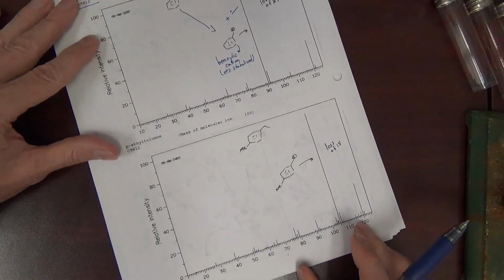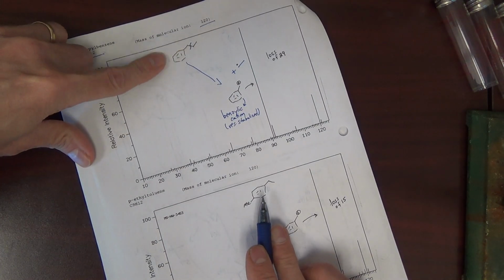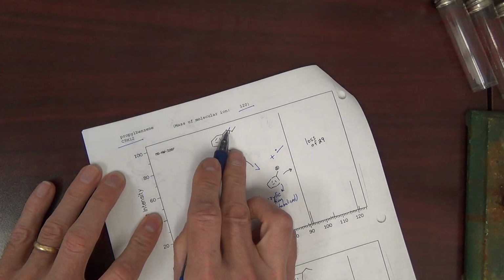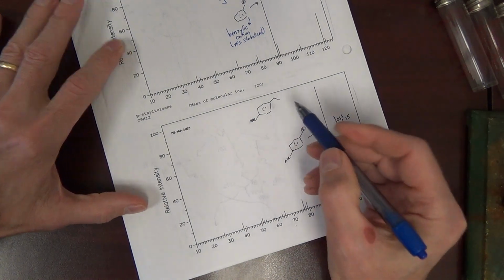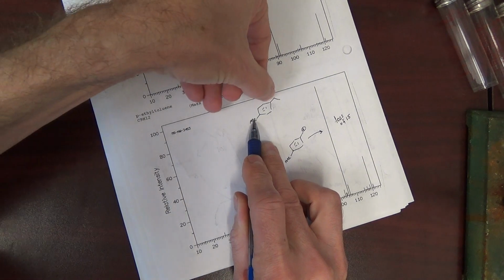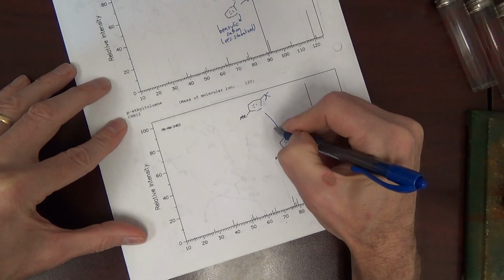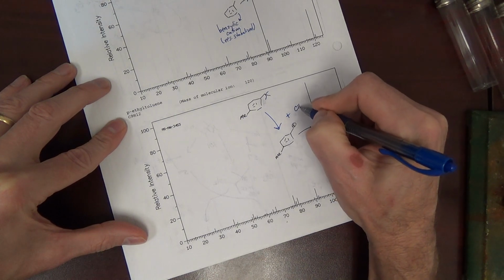Okay, look at the compound below though. These are constitutional isomers. Same formula, different connectivity. Up here, we cleave between the benzylic carbon and the next carbon. Two benzylic carbons. This is a CH3. That's a benzylic carbon. That's a benzylic carbon. But only this one has a carbon connected to it that we can cleave. We're going to cleave here. That's going to give this plus what? A CH3 radical.